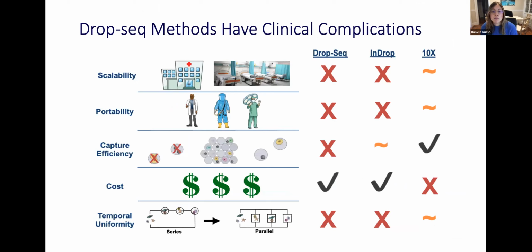And as discussed before, these droplet-based methods also present some differences in terms of scalability or capture, as we mentioned with SmartSeq, which had an 80% capture rate. DropSeq tends to have the disadvantage of this low capture efficiency. The result is that we have this emulsion happening and you end up with lots of droplets, but only very few of these droplets actually encapsulate a cell.